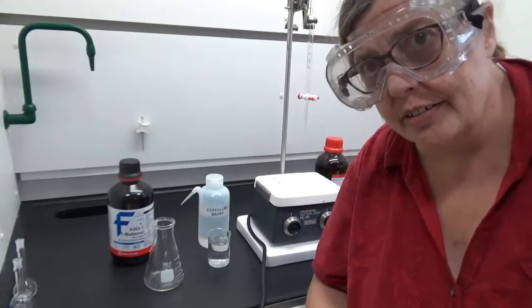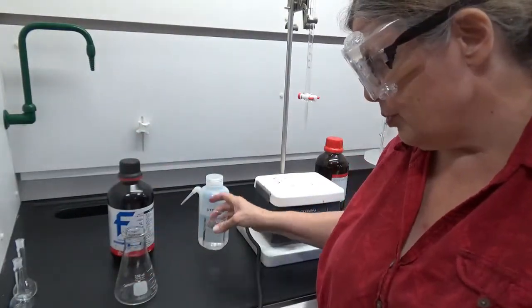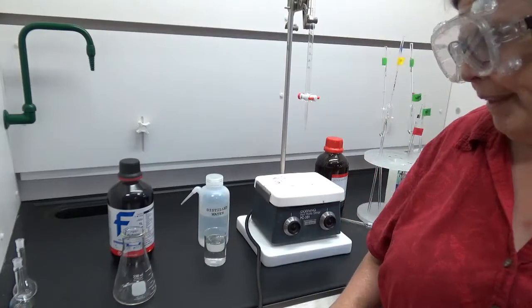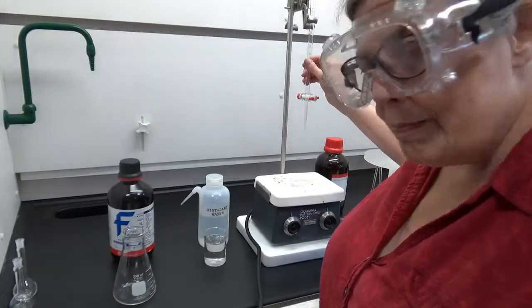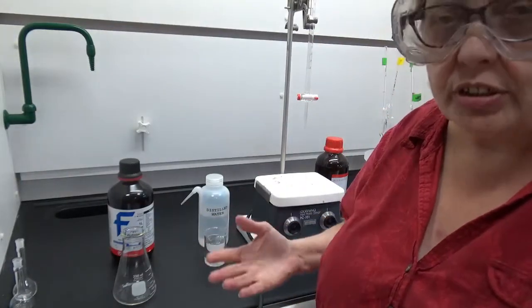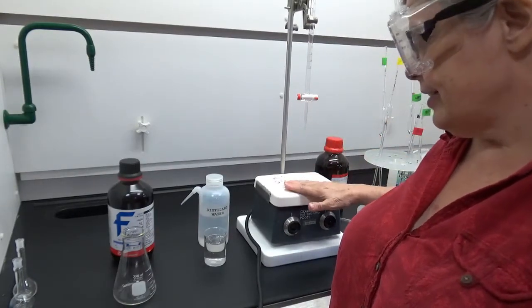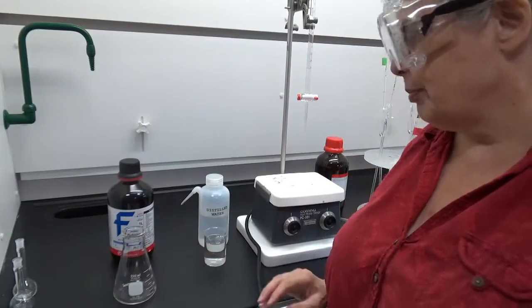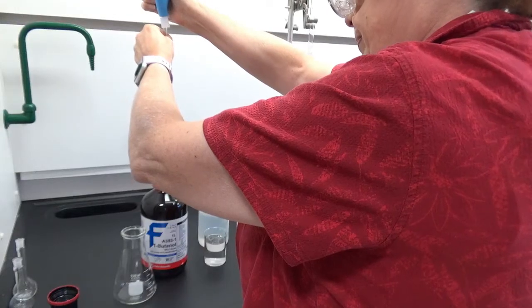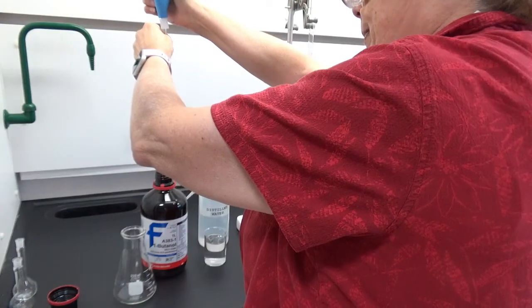We're in part 3 now, and I'm going to pipette 20 milliliters of butanol into here, and then this is water. I'm going to pipette 5 milliliters of water into the same flask. Then I'm going to prepare this burette by putting concentrated, glacial acetic acid in it, and I'm going to get ready to drip the acetic acid into this water butanol mixture while it's stirring. So that's the basic idea. Everything is all clean and dry.